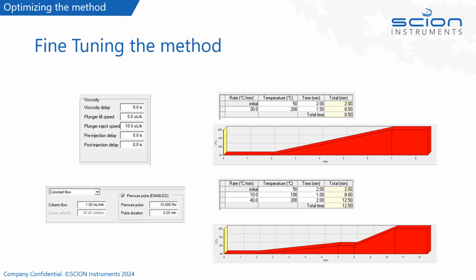And then at the end, if there's no longer anything that we're interested in, then we can very quickly ramp it up to our burn off temperature at the end there.